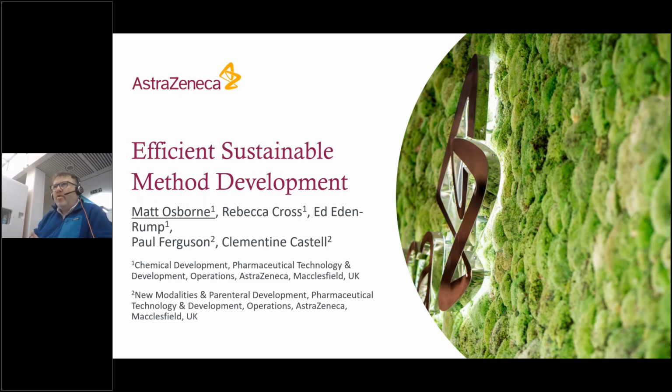So I'm going to give an overview of the way we do method development now in AstraZeneca within the development organisations compared to how we were doing it a couple of years ago, and hopefully explain to you how we've been able to make our method development process more efficient through the use of in silico modelling.